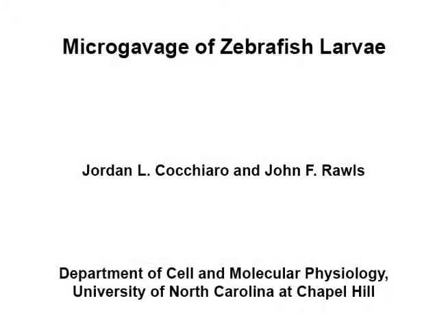The overall aim of this procedure is to orally administer materials to the intestinal lumen of zebrafish larvae. The main advantage of this technique over existing methods, such as immersion into water containing the material of interest, is that the amount of material delivered into the animal, as well as the timing and dosage, can be rigorously controlled. This decreases experimental variability, and in some cases toxicity, associated with certain materials.